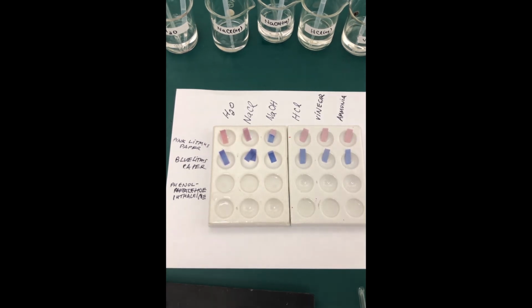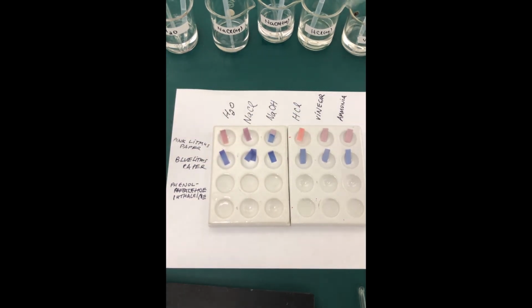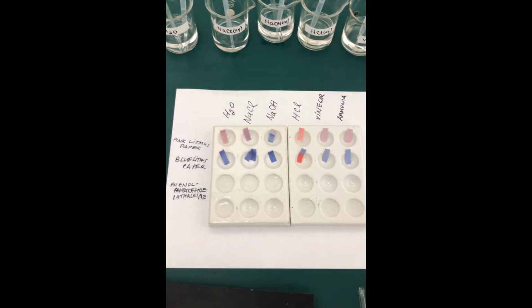Let's try out now the HCl. First against the pink litmus paper. And again, we don't see any significant change other than it's getting wet. Let's try it against the blue litmus paper now. Oh, that's a significant change. As you can see, it turned pink. Actually, almost red in color.